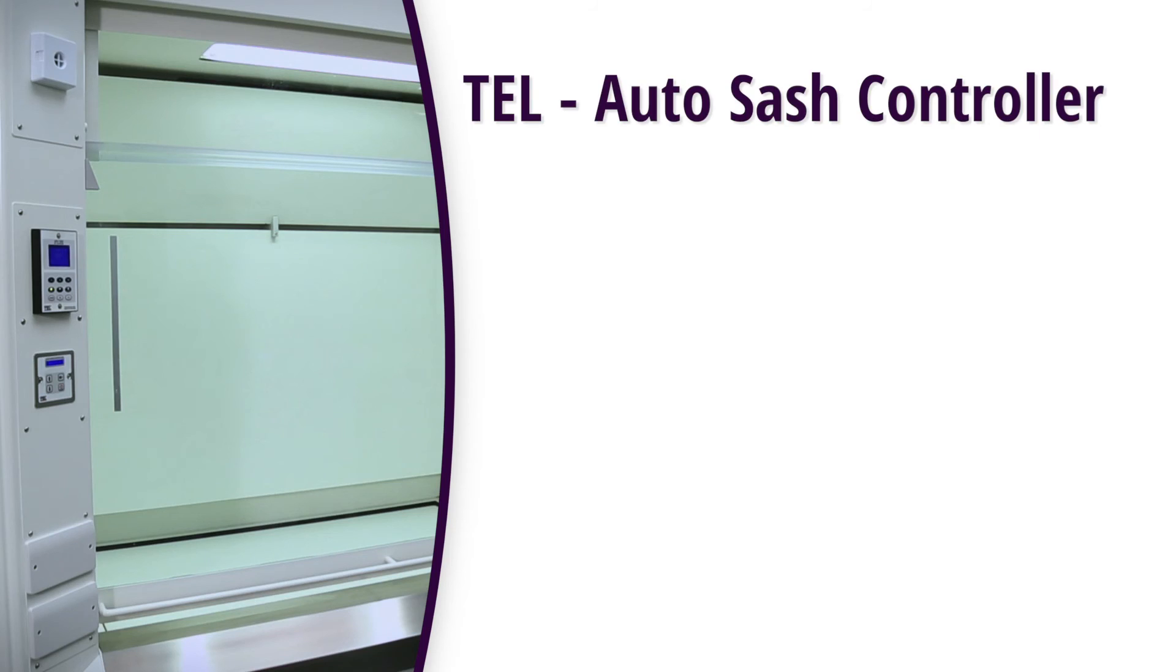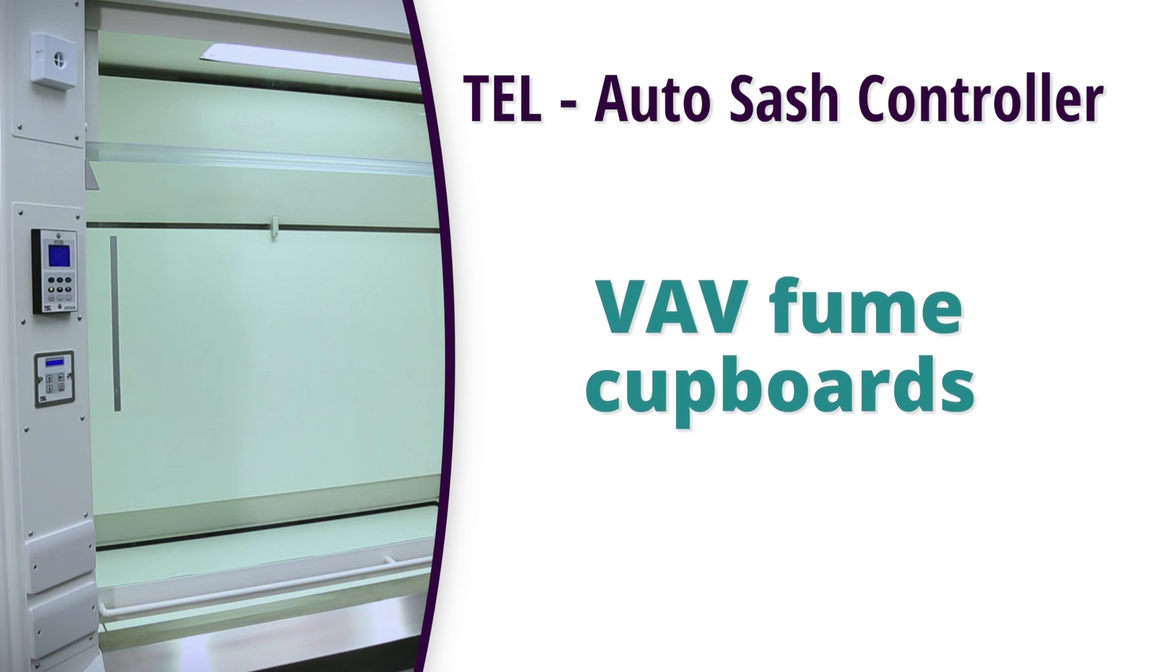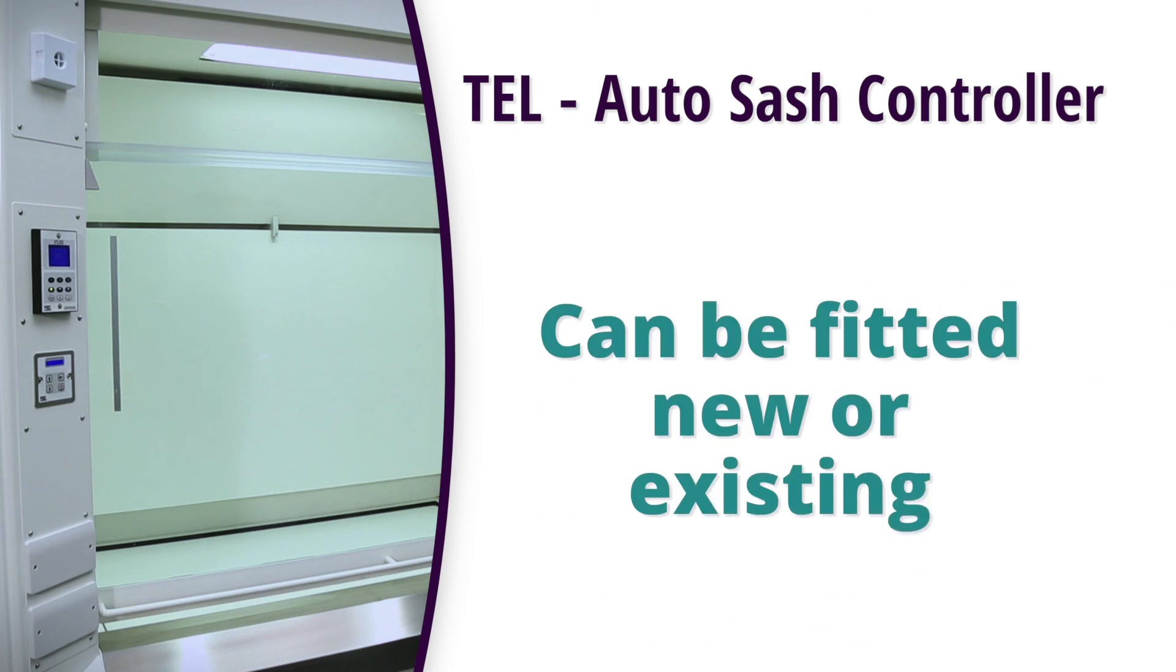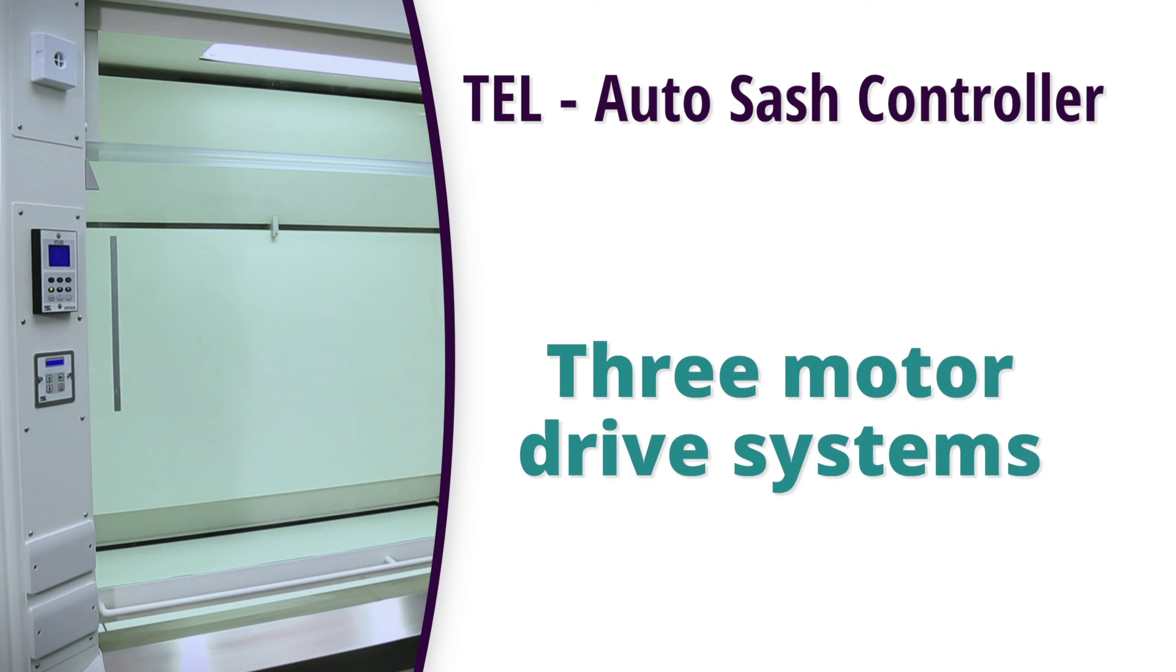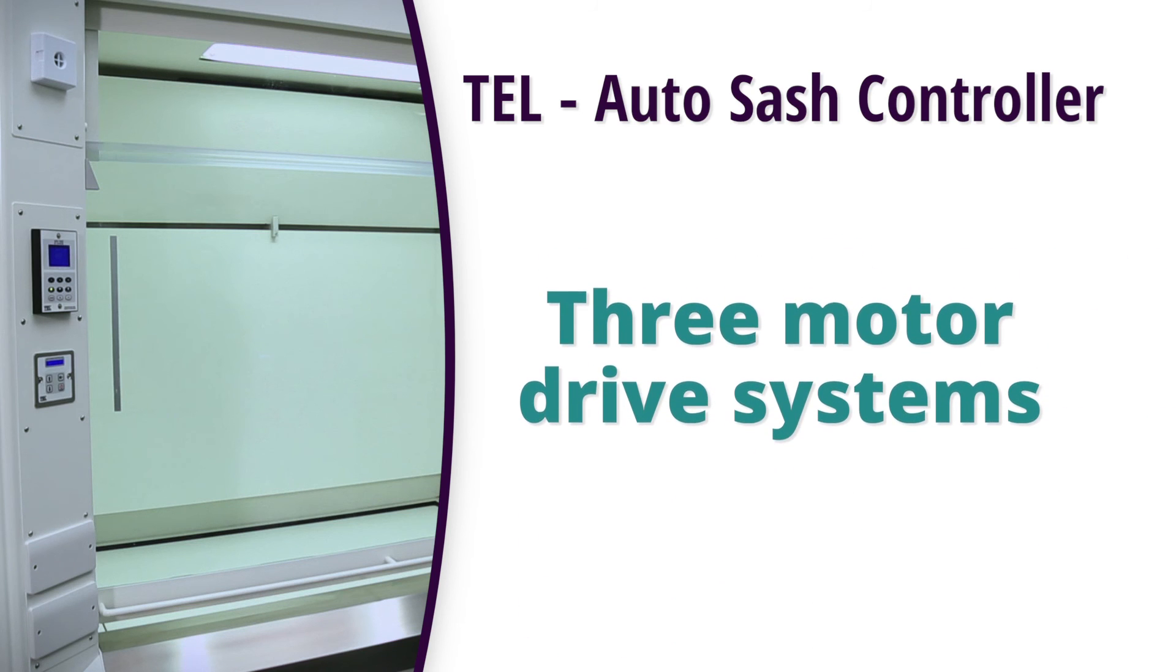TEL's auto sash controller will work with VAV fume cupboards and also on CAV fume cupboards and can be fitted new or existing with a choice of three motor drive systems to suit each type of fume cupboard.